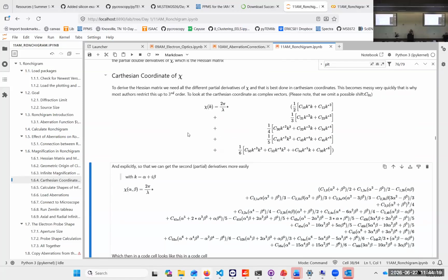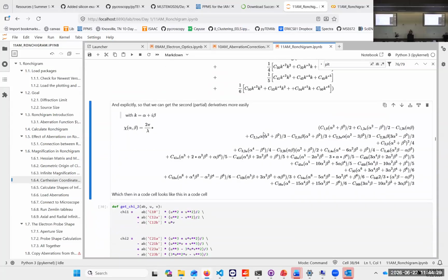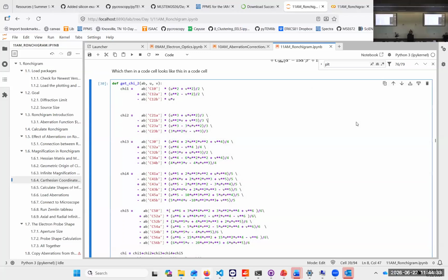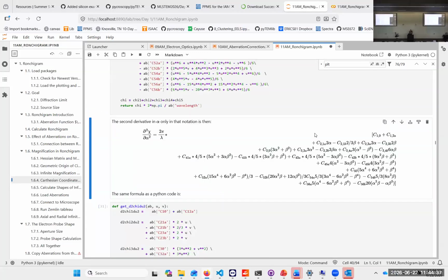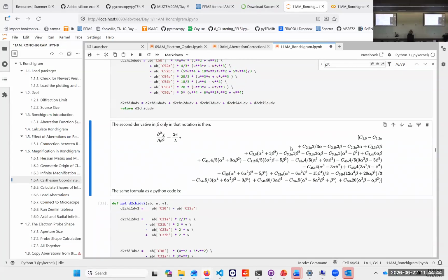If we do that for the whole aberration function, which is of course relatively complicated, then we have a much more complicated change in the magnification. So our zero points are a bit more problematic. I put them all here.